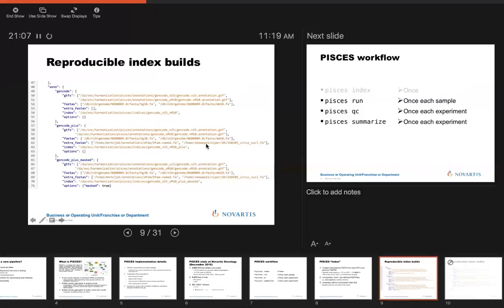non-redundant viral genomes. And then it's also worth noting that the transcriptome sometimes includes repetitive elements that are expressed in genes. And one big advantage of a method like Salmon is that it does map one read to multiple locations.